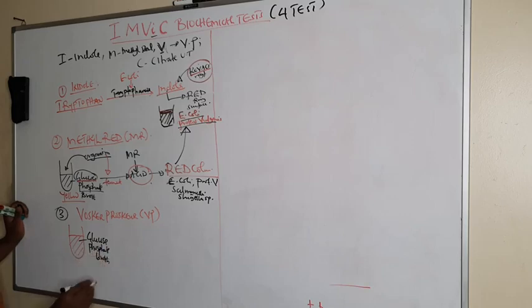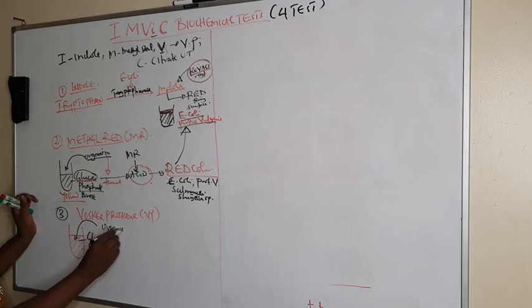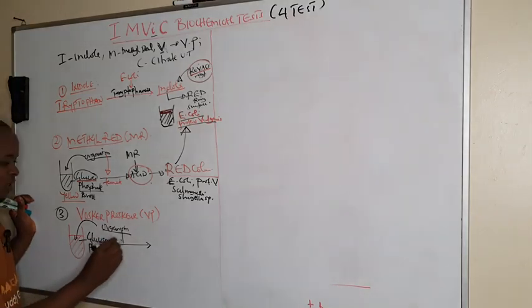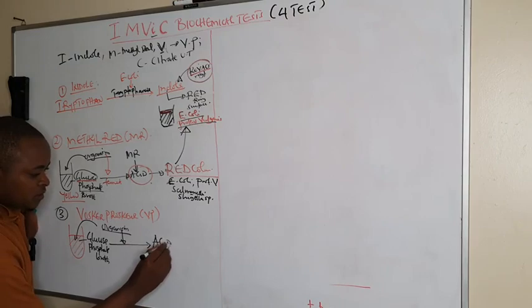As we said, the phosphate is acting as the buffer. So when we come and add the organism in question, that is the enterobacteriaceae, we are seeing how it is able to ferment the glucose in the broth to produce the pyruvic acid.